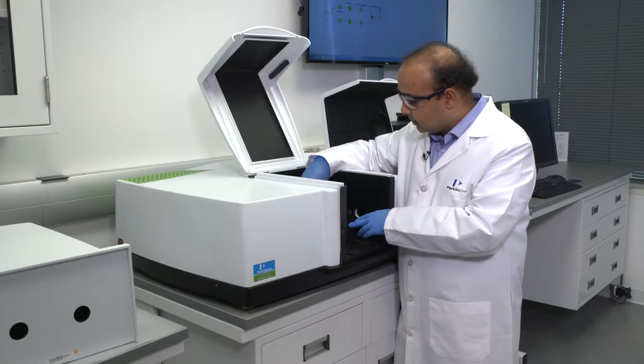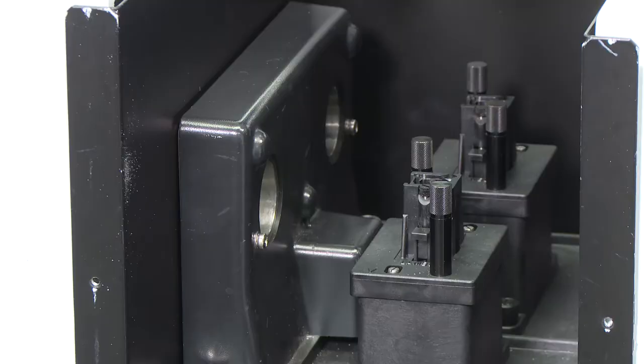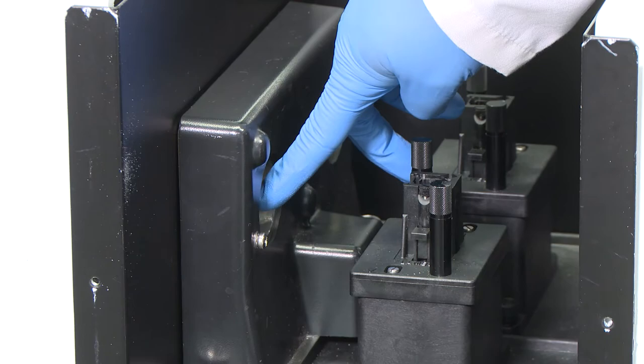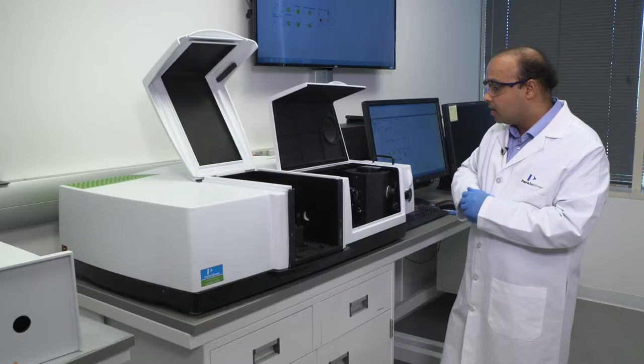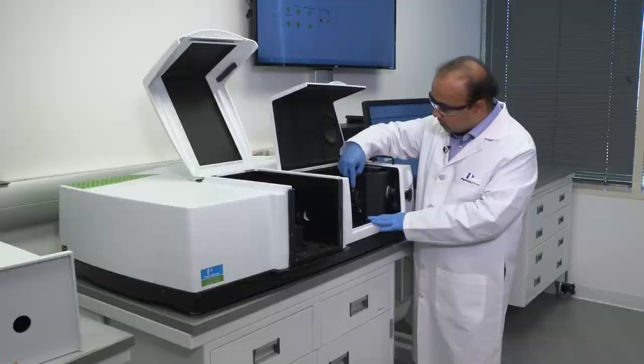You have two cuvette holders here. These are standard 10 millimeter liquid cuvette holders that are capable of measuring absorbance through the sample, as well as a polarizer drive that is capable of measuring angular polarization of our optical samples.